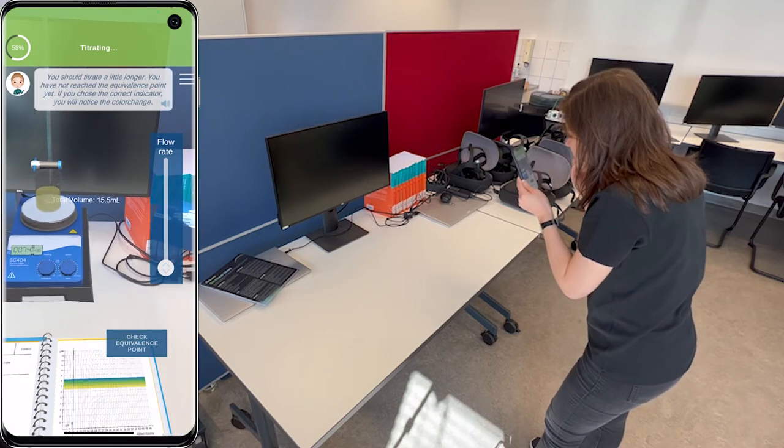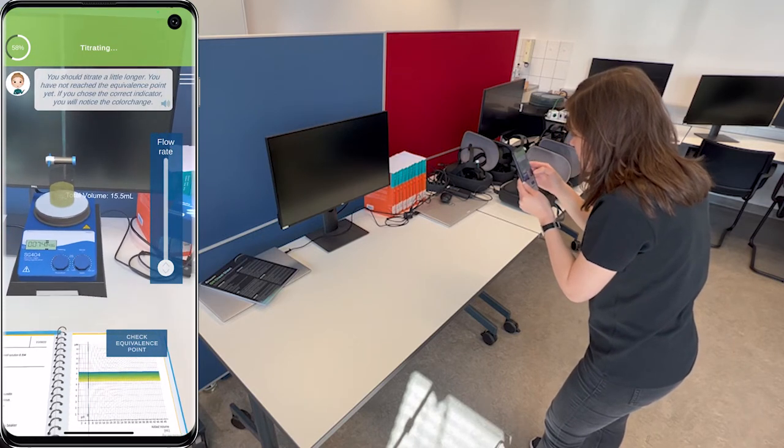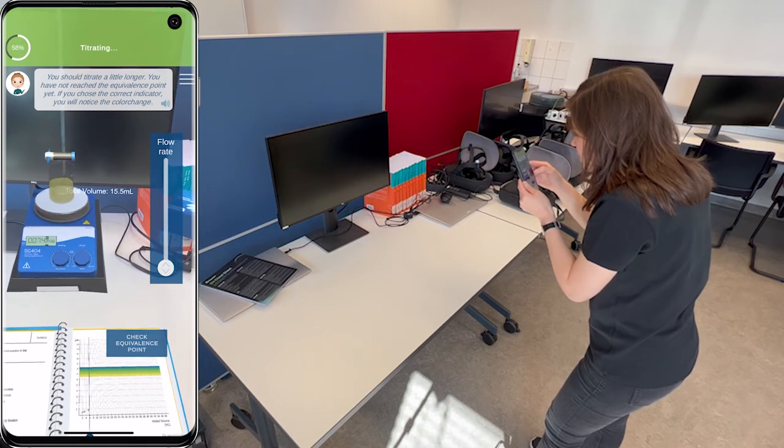You should titrate a little longer. You have not reached the equivalence point yet. If you chose the correct indicator, you will notice the color change.